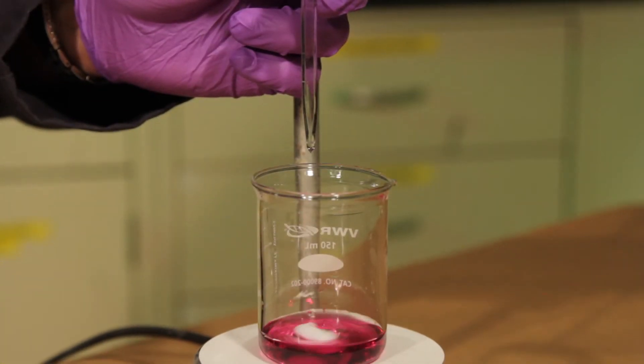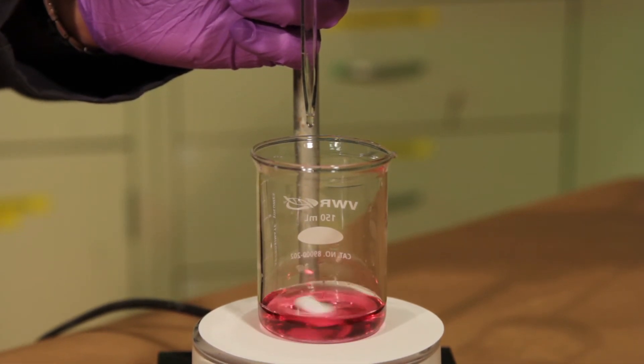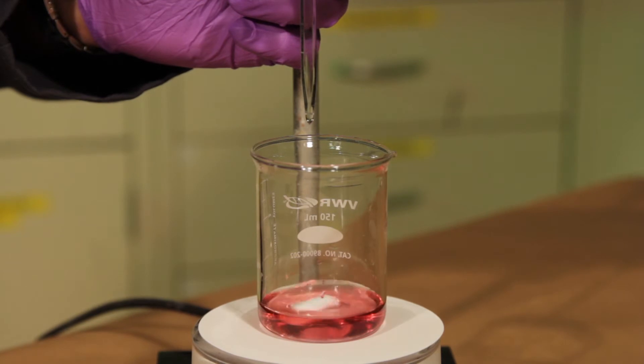Eventually, we will need to add the titrant at a slow rate, even one drop at a time. At the endpoint, the indicator will change color, and we can stop additions and read the graduations on the side of the burette.